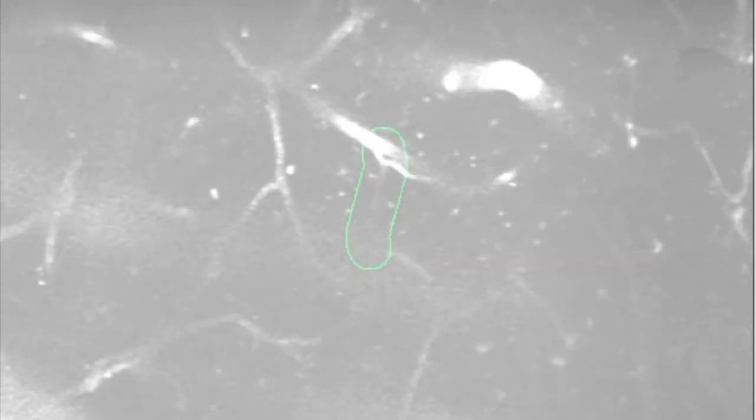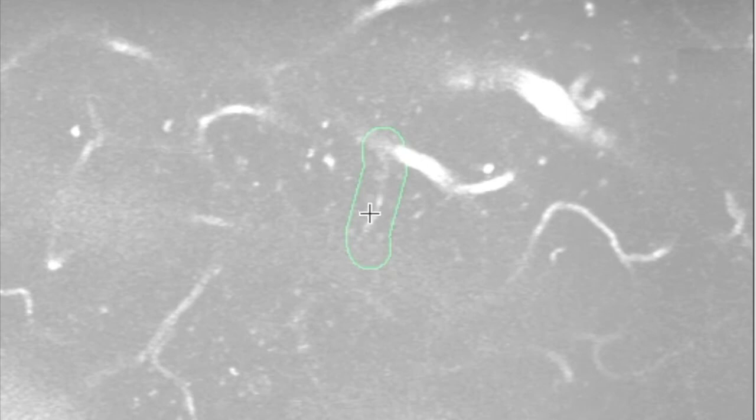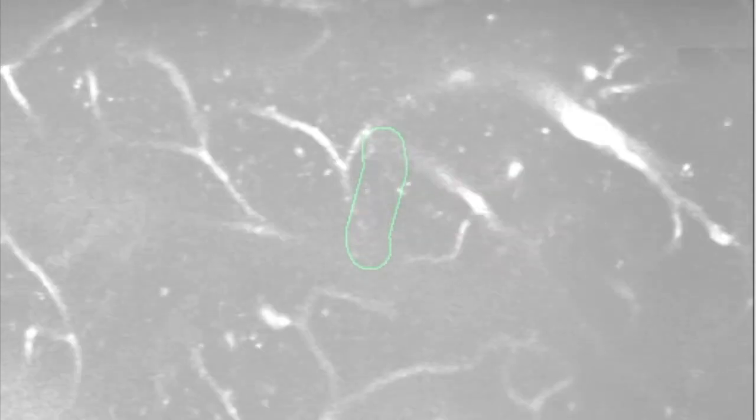Again, this is very normal, but this is still considered a beginner image because these pieces of black in the middle are stagnant throughout the entire image. Another interesting thing about this image is this line up here. This is again due to stitching of the images that occurs during our processing, and it's very normal to see, and it shouldn't cause any problems with the image analysis process.